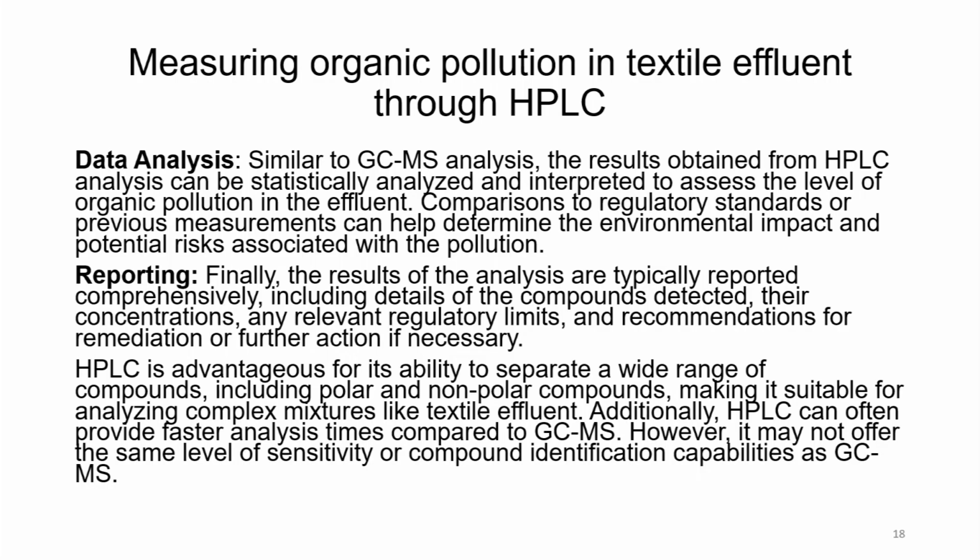Data analysis, just like what we did in GCMS, and we saw here also, the results obtained from HPLC analysis can be statistically analyzed and interpreted to assess the level of organic pollution in the effluent. Comparisons to regulatory standards or previous measurements can help determine the environmental impact and potential risk associated with these pollutants.